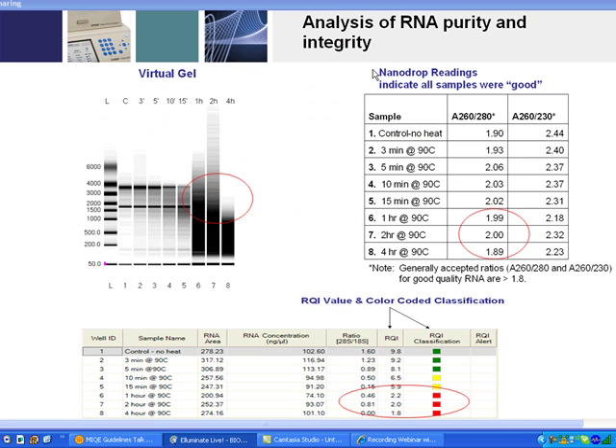To emphasize why we need to measure both purity and quality: looking at nanodrop readings — a spectrophotometer that reads very small volumes — we see that across this heat degradation experiment, where RNA was heated to 90 degrees over time, the RNA concentration levels didn't change very much from beginning to end, and all samples appeared to be very pure. A pure sample is typically an OD260/280 ratio of 1.8 or greater, and all of these samples were above 1.8.